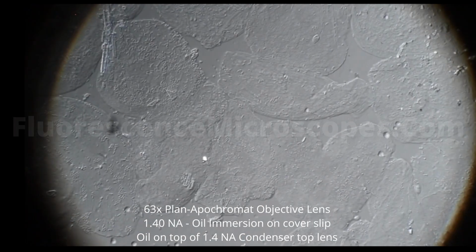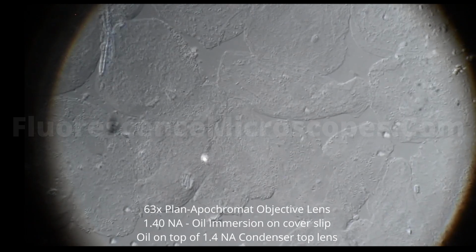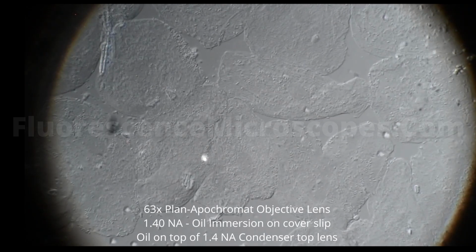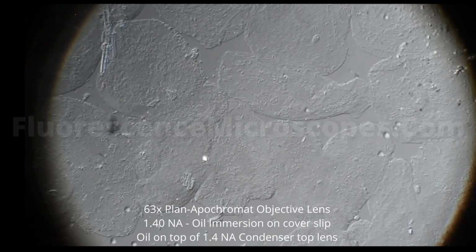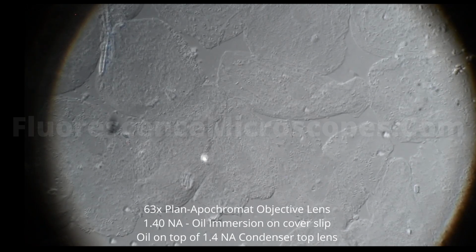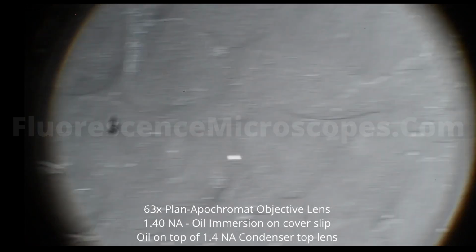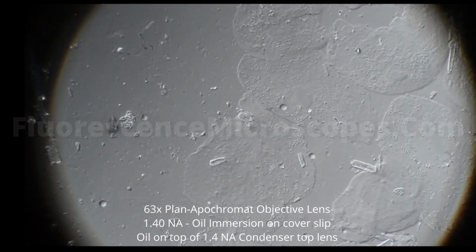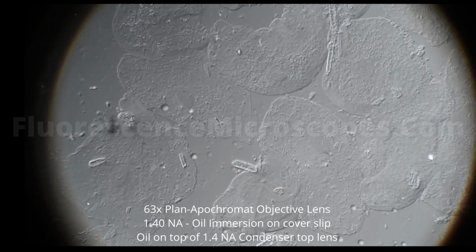Okay, now we've got a Plan-Apochromat 63x 1.4 oil DIC objective lens. This lens is rated for DIC. It's got the DIC marking on it. And I happen to have an oil immersion condenser that's a 1.4 numerical aperture. So I'm using a drop of oil on the top lens of that condenser. Normally condensers are 0.9.